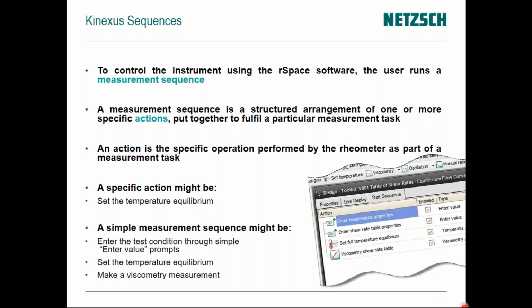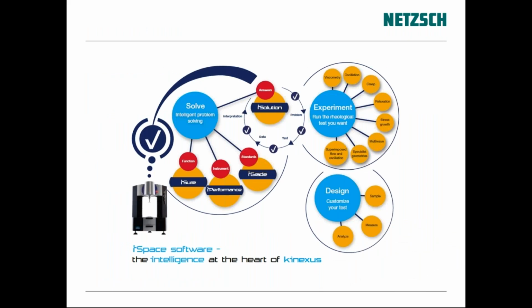You can drag and drop these actions in if you want to create your own sequence, but we also have some predefined ones, which makes it very easy for a new user. Now, when they designed the software, Malvern Panalytical did a survey and asked people what they would like, and the overwhelming response was that people wanted more assistance with doing rheology. They needed to know what test was most appropriate and then how to interpret the results. So the engineers came up with this kind of design module.